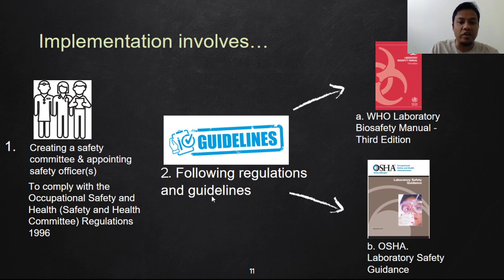Second, by following regulations and guidelines. As we all know, the medical laboratory is strictly regulated. First, by applying and following the WHO Laboratory Biosafety Manual, and second, by the Occupational Safety and Health Laboratory Safety Guidance.